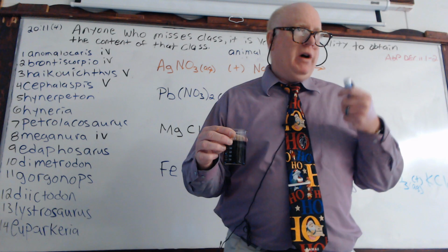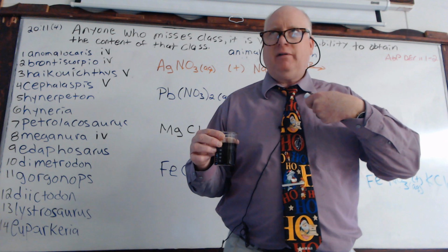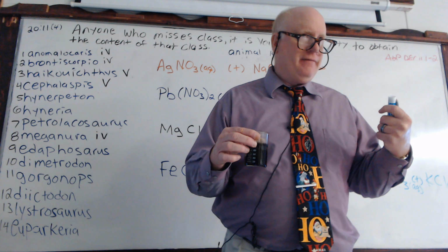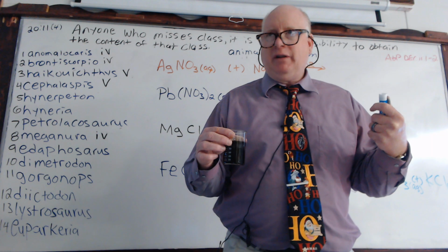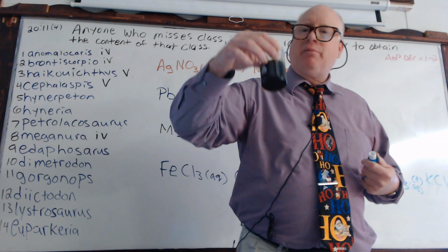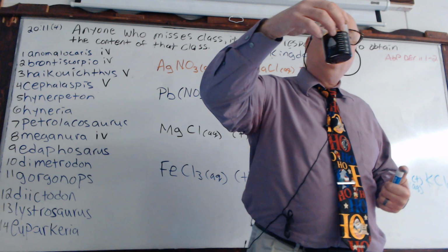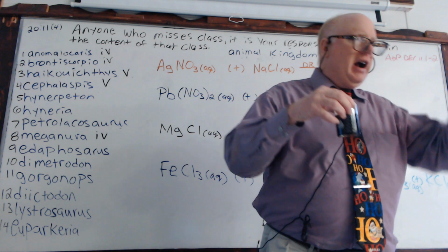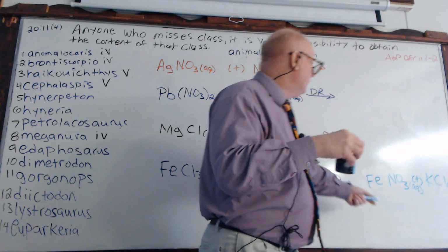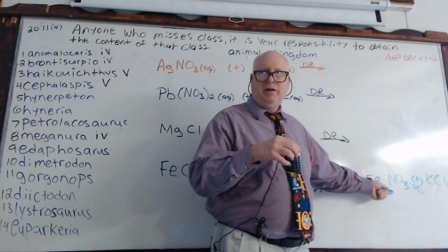Blood. How do we carry oxygen throughout our body? Iron. So the hemoglobin is red because of iron. You're adding this, and it's becoming a deeper red solution because that iron is just being expressed. It's not precipitating out because it can't, because nitrates are too soluble.